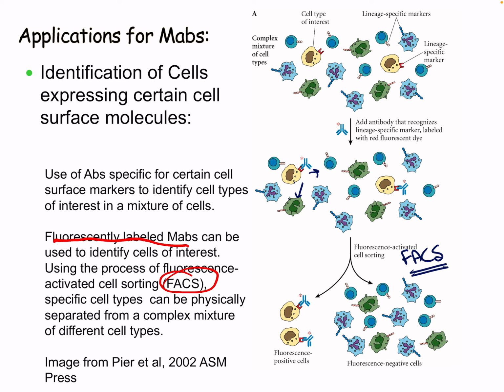So here we can see the fluorescent positive cells, and we can put in a bunch of different antibodies as well. One can be green, one yellow, for example, and these will detect different markers. So when we go to count, we can know, okay, the green was the macrophage and the yellow was the NK cell, for example. So it allows us to see what stuff is happening, and it's pretty impressive.